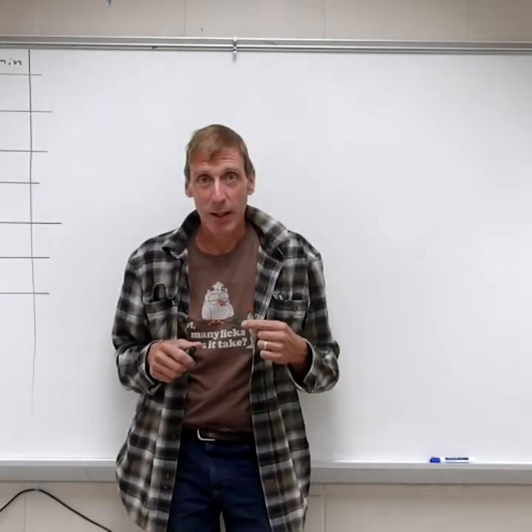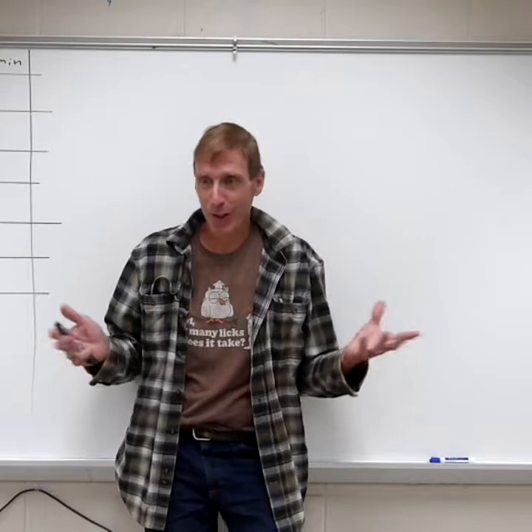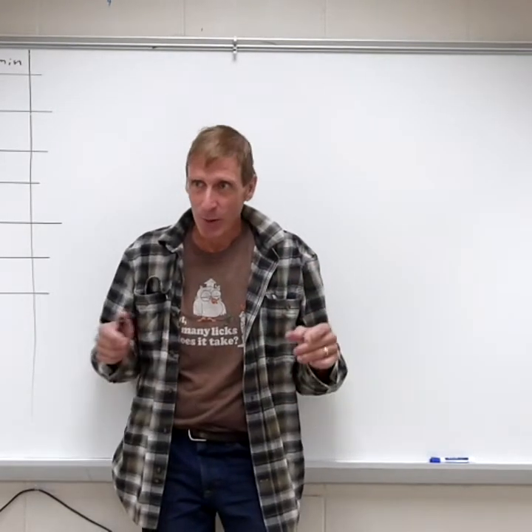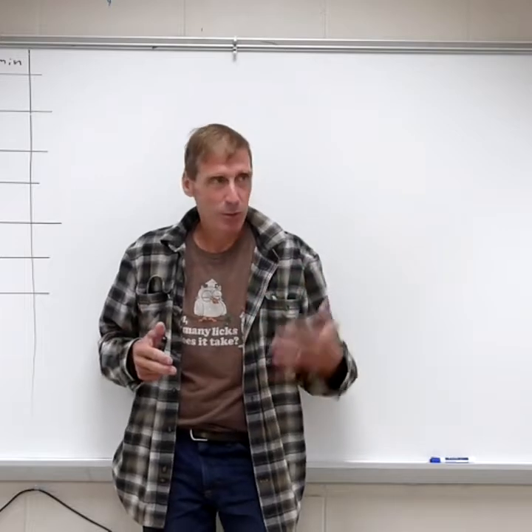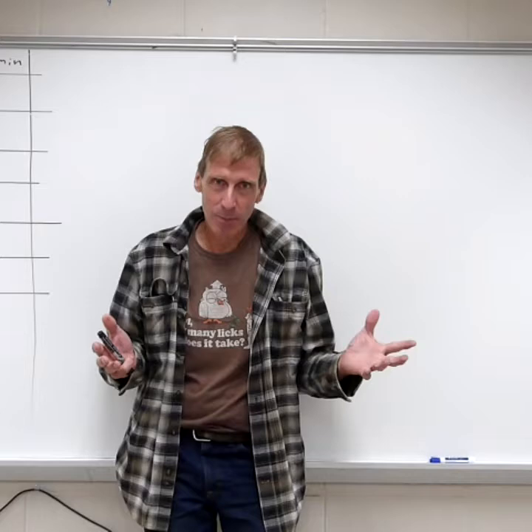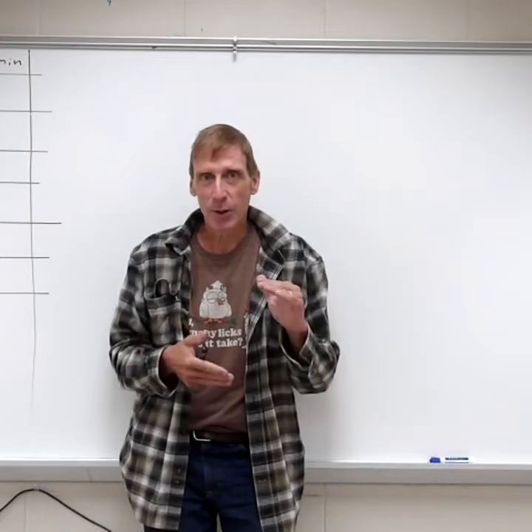This is an indoor lab. You'll notice there's no puppy, Mr. Squiggy, in here. This one's one of the ones we normally do in the classroom. You'll look on your lab folder for lab number 3. It's a metabolism lab. You'll have a handout, the one we normally use in lab.